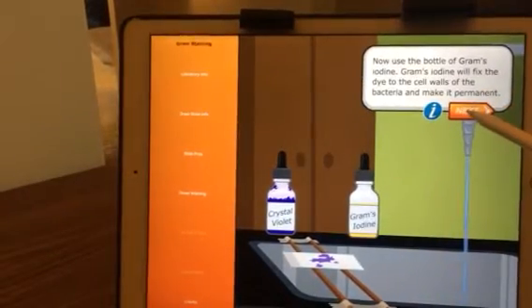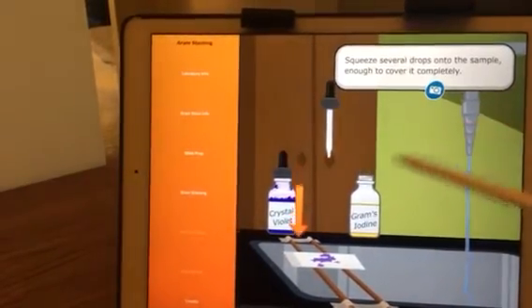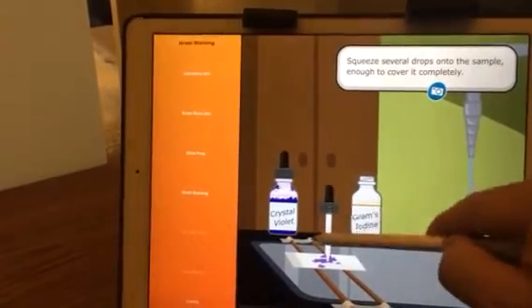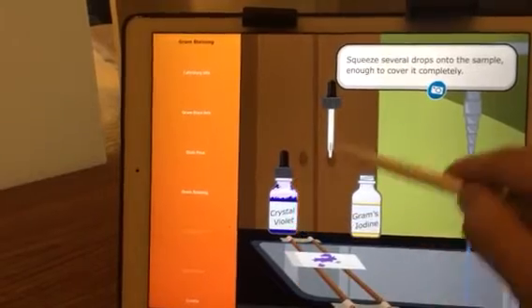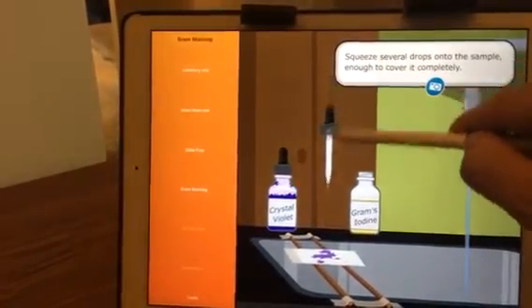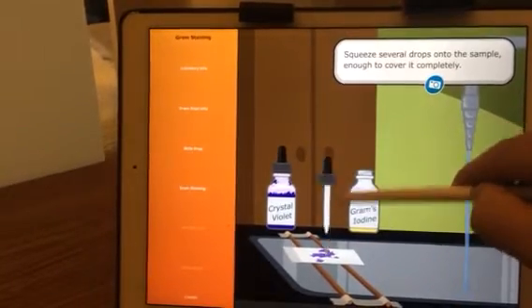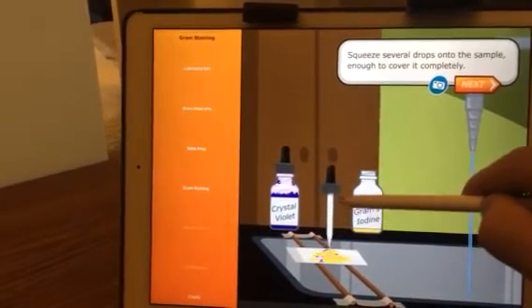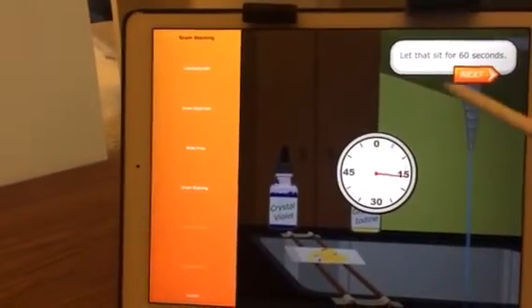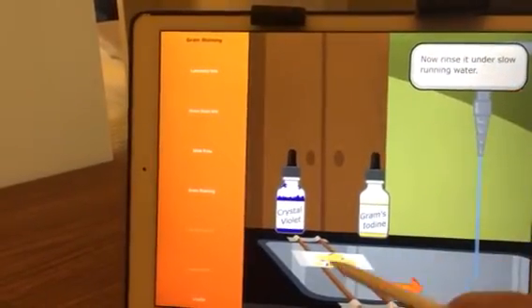Now use the bottle of Gram's iodine. Squeeze several drops onto the sample, enough to cover it completely. Let that sit for 60 seconds. Now rinse it under slow running water.